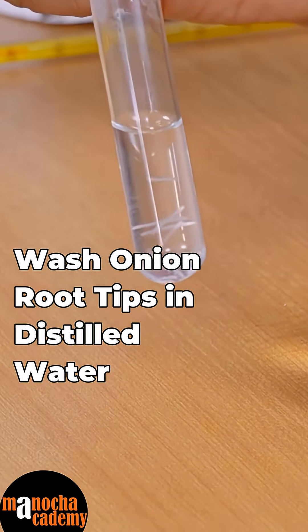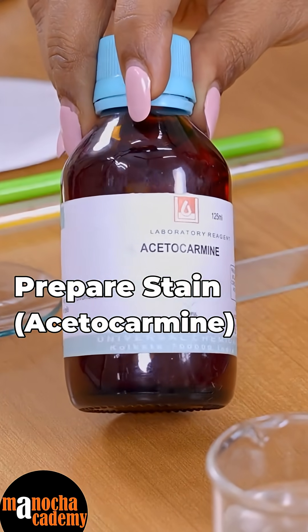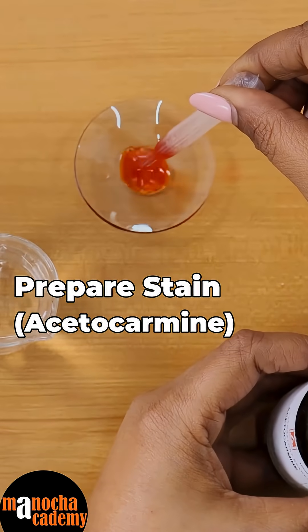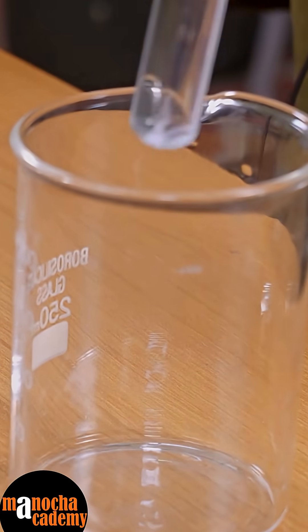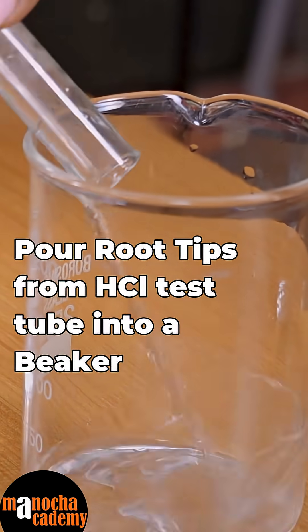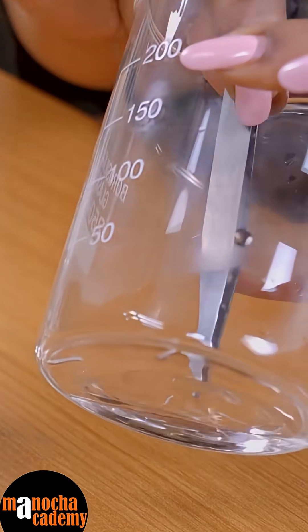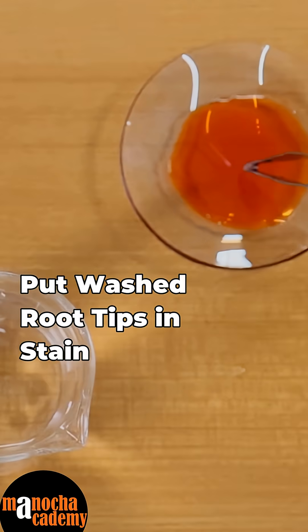Now I will take the root tips and wash them in distilled water. I will get the stain ready first — for that we have taken acetocarmine. I will take some acetocarmine and put it in the watch glass, then quickly wash the root tips in distilled water by pouring the content into a beaker, pick up the root tips, wash them very quickly, and then put them in the stain.